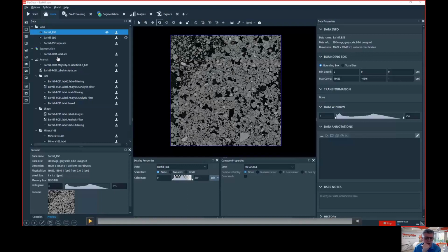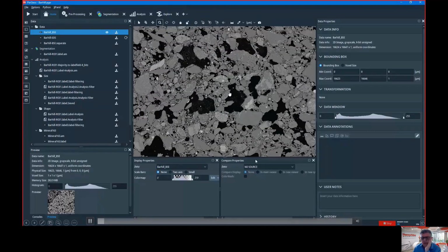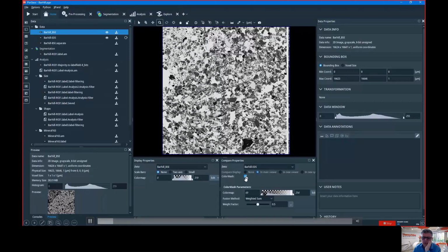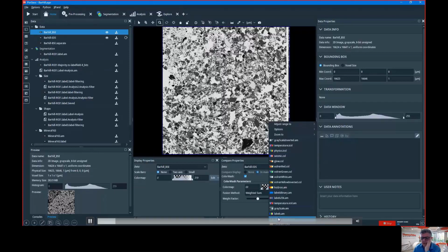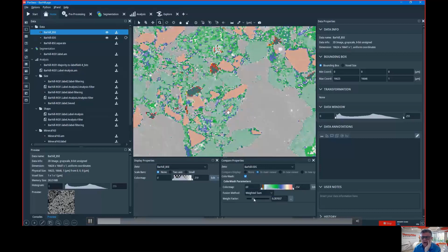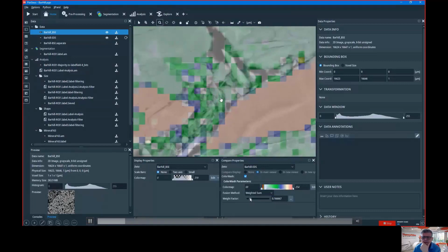So I have a full project with all the analysis. I'll try to go quick because I think it's a bit long. This is your input BSE image, and this is your EDS image. I will probably activate color wash and then choose the right color map to see the color of minerals. And as you probably know, they're not the same resolution.